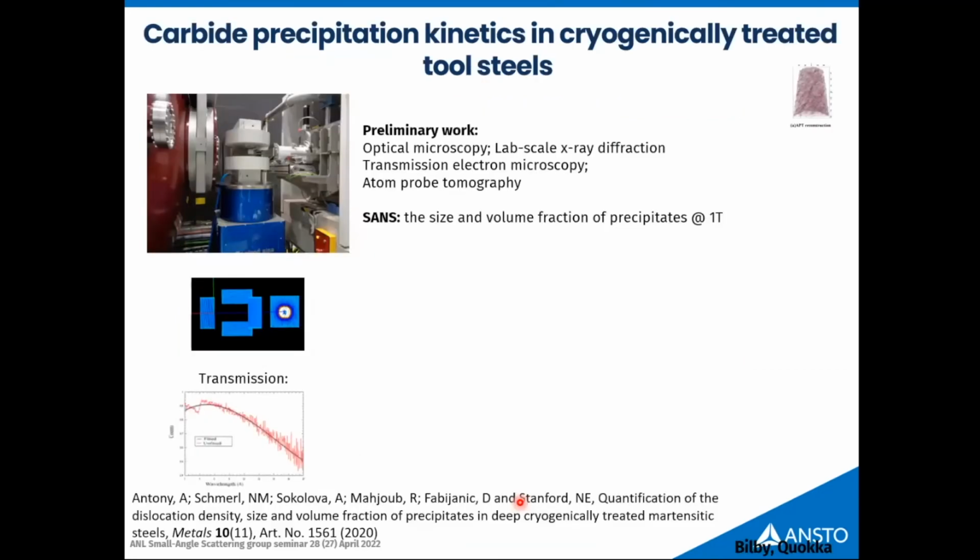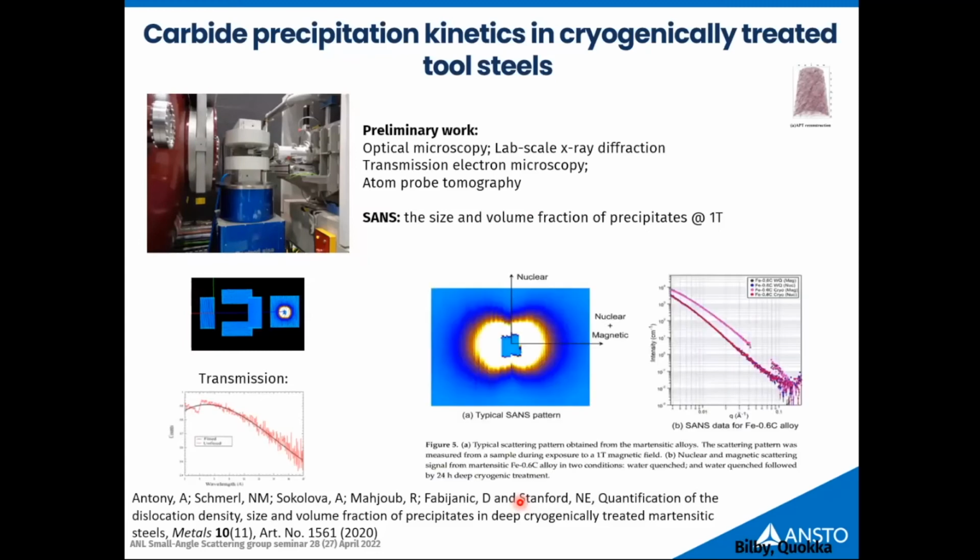Right. Just an example why time of flight is quite interesting on hard matter. This is an example to study steel. Not going into many details, but one thing to say, steel quite often works like a magnetic matrix, which is iron, and some non-magnetic impurities. So something non-magnetic in magnetic. Neutron contrast is there as well, because they're chemically different compositions. But again, as I said before, neutrons have a magnetic moment. Neutrons are sensitive to magnetic features of the element.